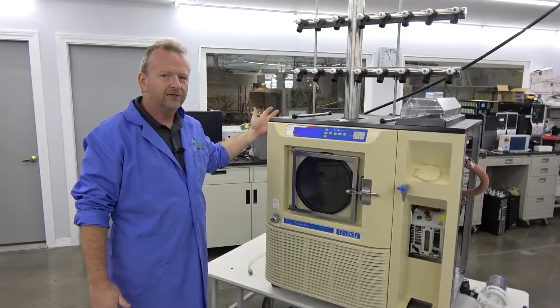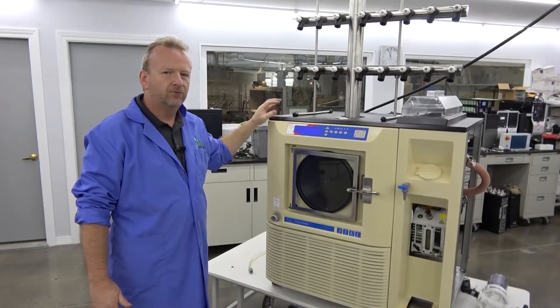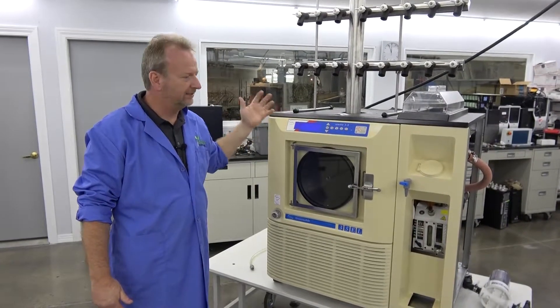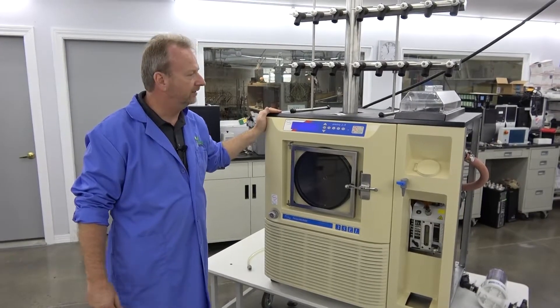We got the back panels off of it and we're going to get some video footage of that, but I thought it'd be great just to point out some of the things that we do when we run these through our tech shop, so that the end user can really see what's happening here.